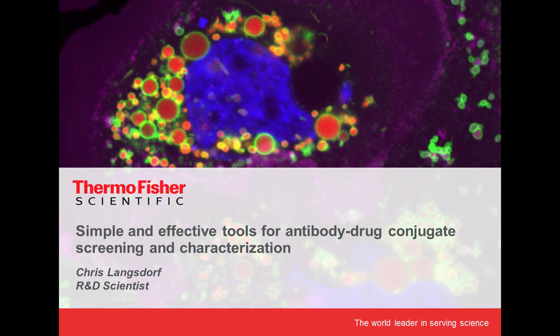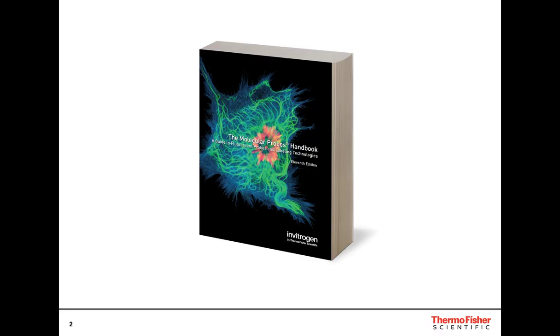As Judy mentioned, my name is Chris Langsdorf, and I'm a staff scientist at Thermo Fisher Scientific in our protein and cell analysis group. And today we'll talk about simple and effective tools for antibody-drug conjugate screening and characterization. Now, in our group within Thermo Fisher Scientific, we developed fluorescent reagents, all of the probes and assays we use to characterize our cells using fluorescence microscopy and flow cytometry.